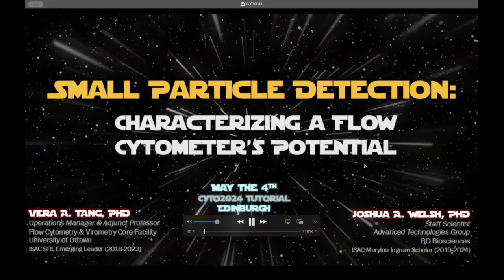Welcome to our webinar today about small particle detection. This was a tutorial that was given at Cyto 2024 in Edinburgh on May the 4th. The title of our webinar is Characterizing a Flow Cytometer's Potential, and we'd like you to know that this is a method that is instrument agnostic. That means it should work with pretty much all of the standard instruments that you would find in your flow lab. I'm Vera Tang.